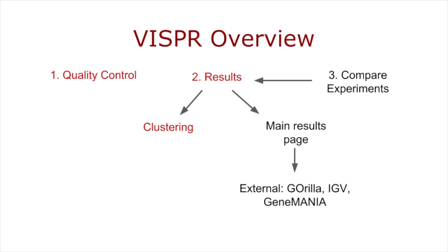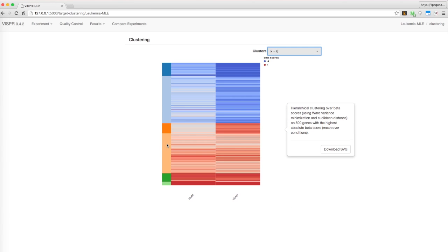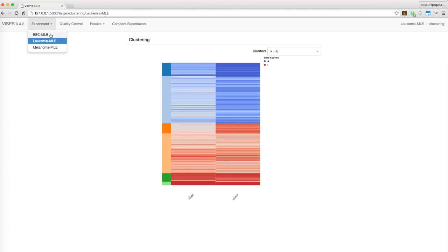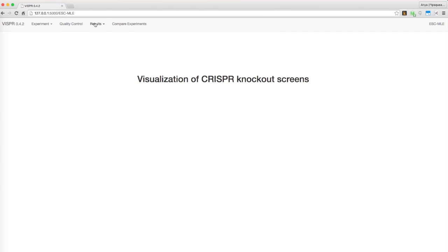Next, let's move on to the gene rankings on the main results page. We'll switch back to ESC in this tutorial so you can see the full range of features Visper offers. Click on positive selection.